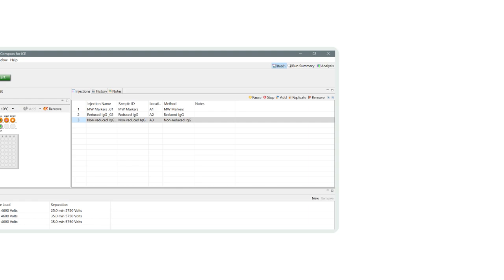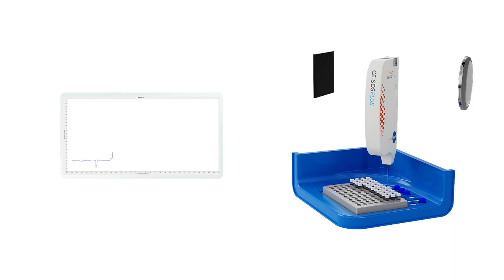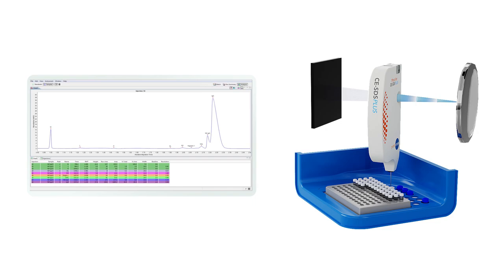The sample is injected into the cartridge based on the location you define in the batch. Compass for ICE, or Empower Software, lets you run multiple methods in the same batch, monitor the separations in real time, and will automatically analyze the data for you.